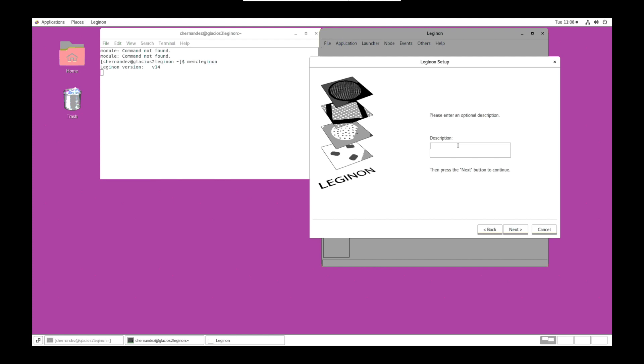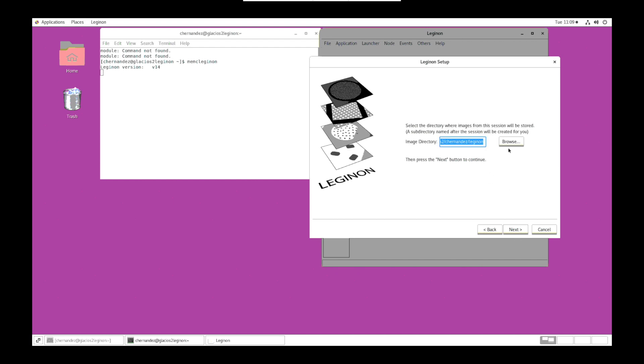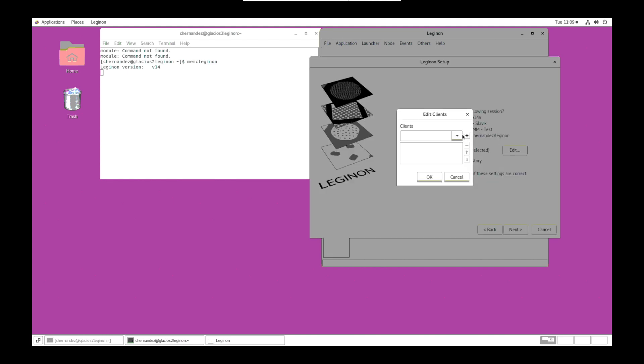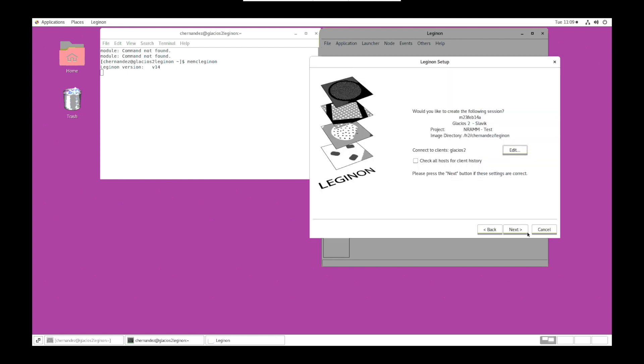For the description, we'll start it off with the microscope's name and then we'll put the LDAP account user's name. We want to confirm the image directory but not change anything. Next.